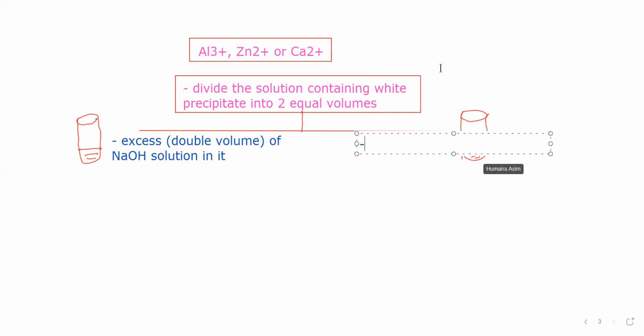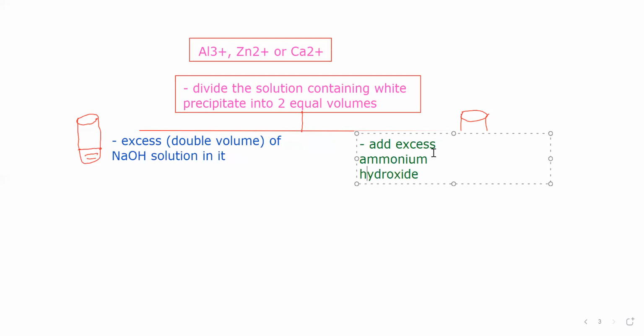Here I am going to add excess ammonium hydroxide solution, or we may also call it aqueous ammonia. Now we will observe the change in both.